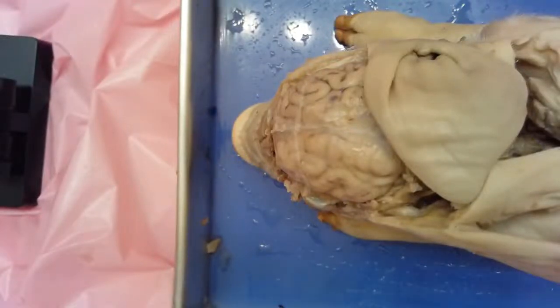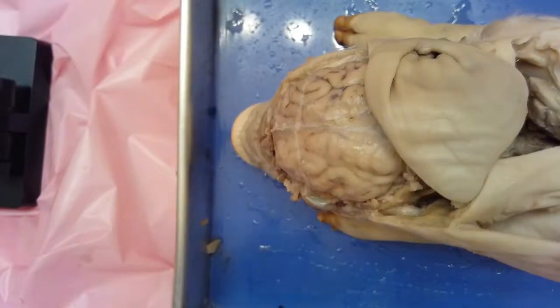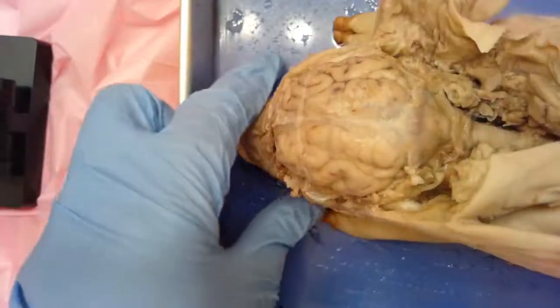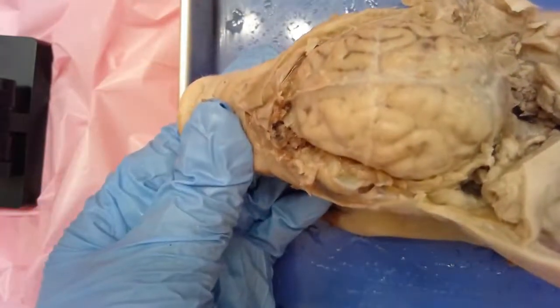All right, so guys, this is our last section, and we are looking at the nervous system, but primarily we're focusing on the brain. I have gone ahead and already opened up the skull and removed sections of it so that you're able to see what we can see of the brain without totally removing it and looking at the underside.